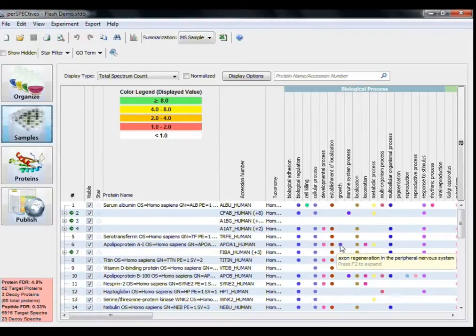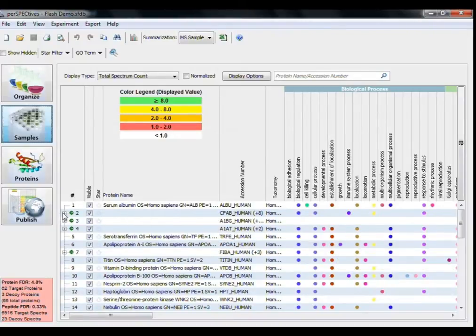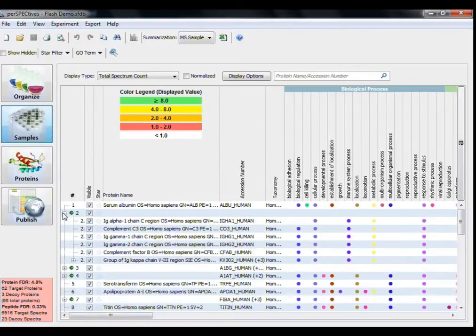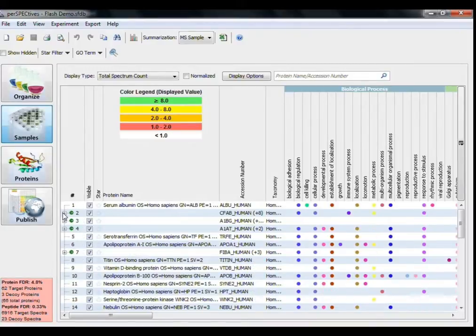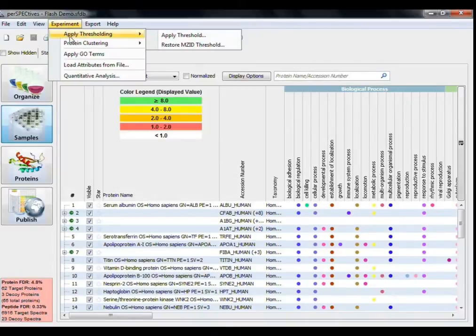I have also enabled one of Perspectives' unique features, protein clustering by GoTerm. To apply other types of clustering, click the Experiment drop-down menu here at the top.